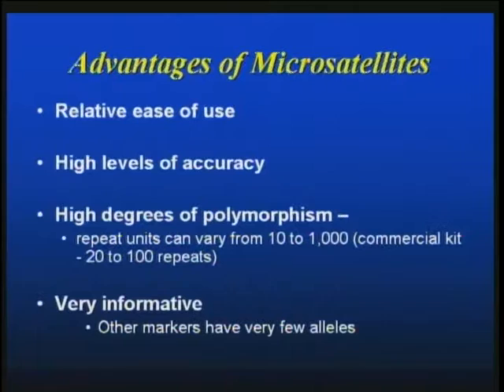So there are a lot of advantages to using microsatellites. One is that they are relatively easy to use. As I said, it's kit-based right now. It's a single PCR reaction. It's multiplexed. You add your DNA and off you go, and then you run it. The major problem, of course, is the analysis, which can be very cumbersome. It's pretty accurate. There are very high levels of accuracy.